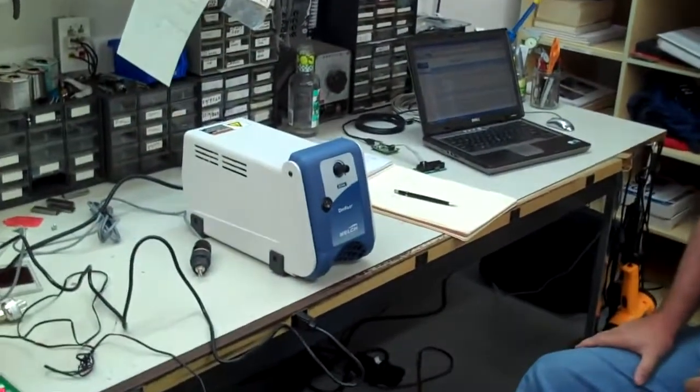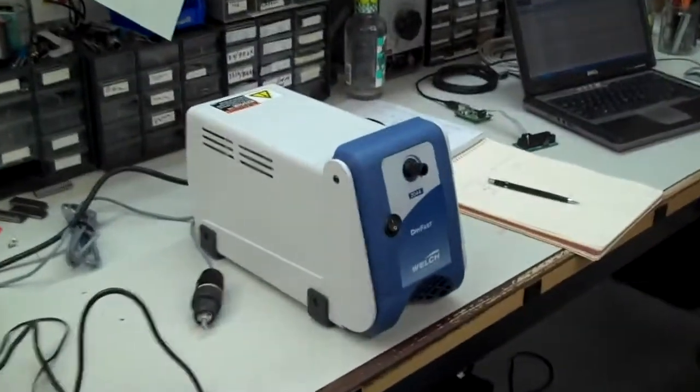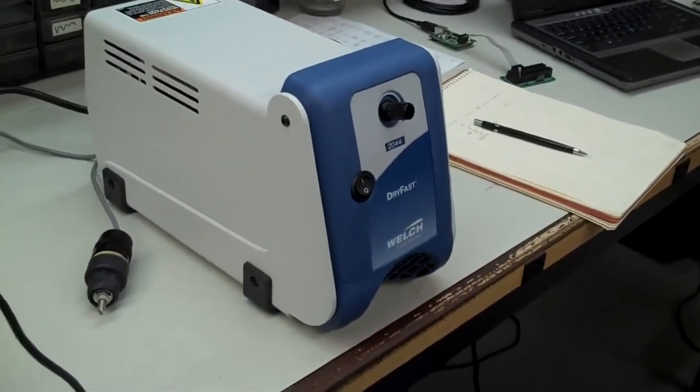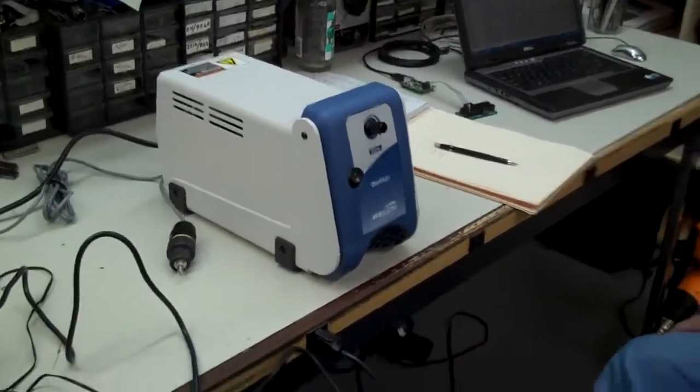The customer asks us, how can you help us control our pump? We said send us your pump, we'll outfit one of our model 200 wide range vacuum gauges with one control minimum, two for an extra control, test it, and send it back to you ready working.